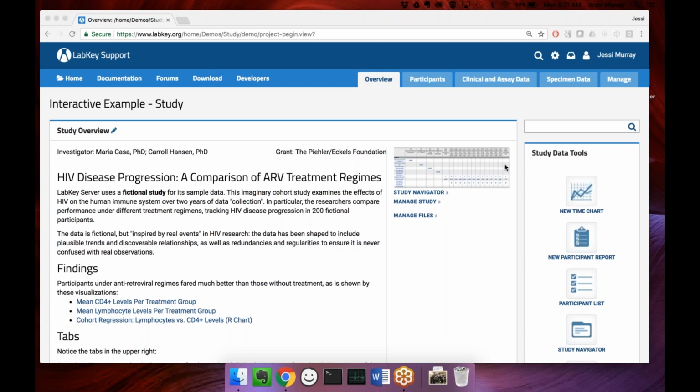But what I can say is that most likely we're going to take a deep look at a lot of the import experiences, so getting data in, whether that's in a data set or a particular assay flow or list, and kind of untangling the confusion around there. So that I can almost guarantee will be one of our big focuses, along with whatever else we decide to prioritize in this next month of planning.